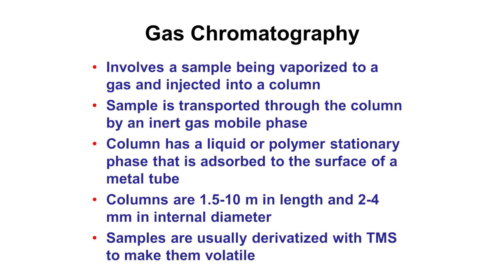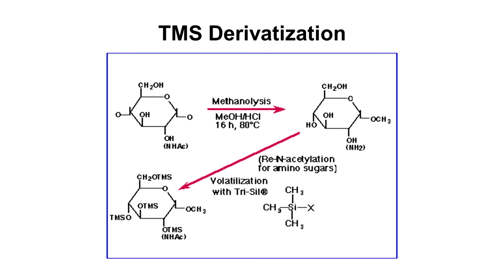Now, many compounds are not easily turned into gases. Volatiles, things that boil at room temperature, those are good examples. But it's also possible to volatilize things that don't turn easily into gases by derivatizing them or chemically reacting them with trimethylsilane or other derivatives with silanes in them. And that can convert an amino acid, an alkaloid, a fat into something that actually is volatile. So key to much of what's done with gas chromatography is this process of derivatization.